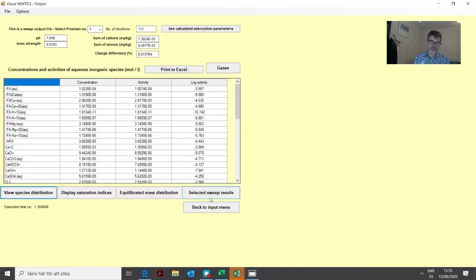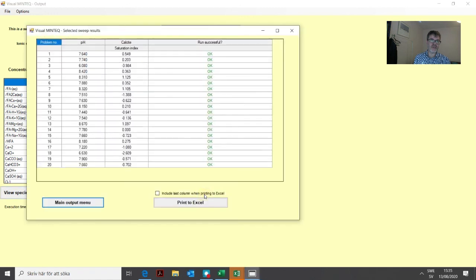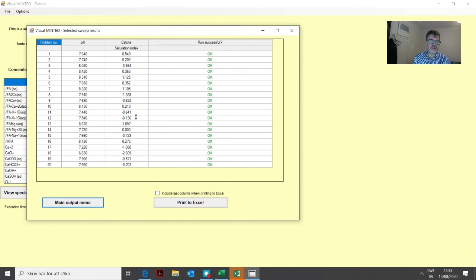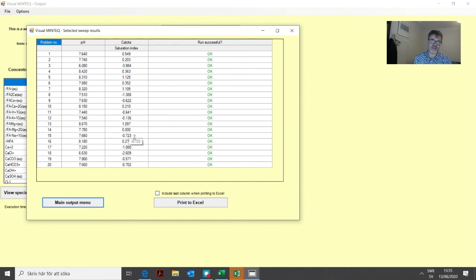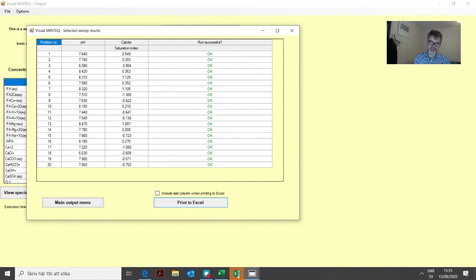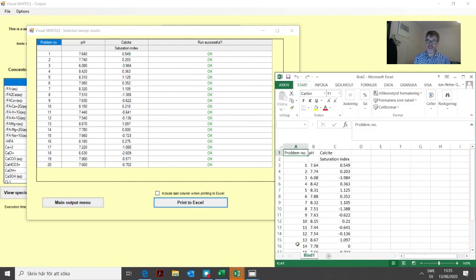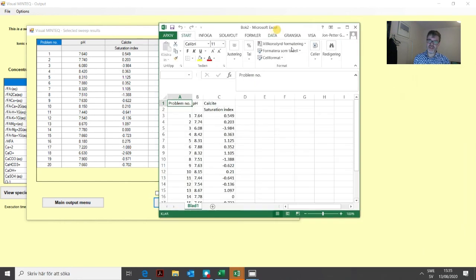You look in the selected sweep results and here is our saturation index of calcite for all our 20 lakes. As you can see, it's rather close to zero in many of these cases, meaning it's probably close to saturation with calcite. Then we can export again to Excel and continue working with this data there.